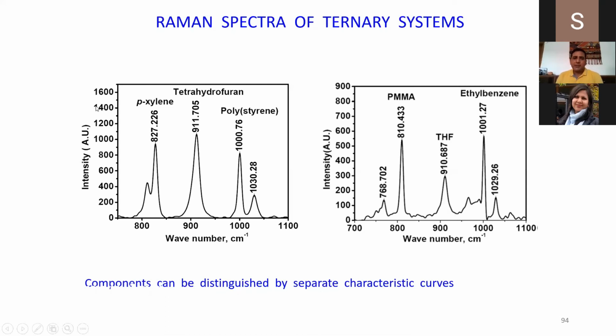Now, once you did it, this is what would come from your Raman spectra only, that's all. What can you do here? They will give you the data in TXT format or Excel format, intensity versus wave numbers. Software always comes with the equipment. You can do complete treatment. You can calculate the peak height and the area of the peak. Everything can be calculated by the software. If they don't do it that way, because sometimes people charge for it and it takes time, you take the TXT format of the data they provide, put it in Origin, and do all these treatments very nicely.